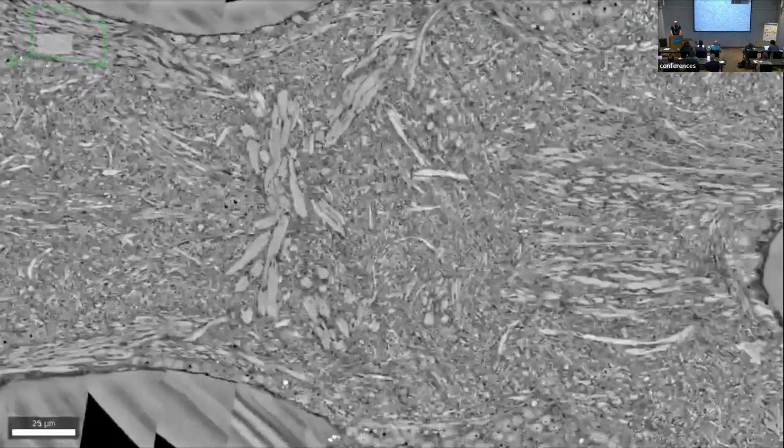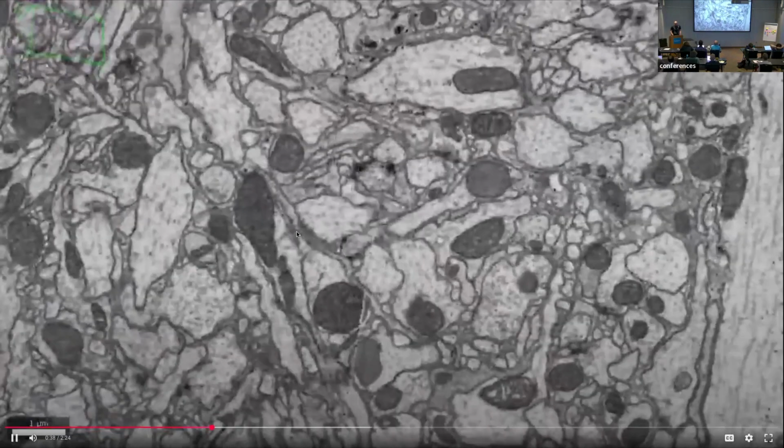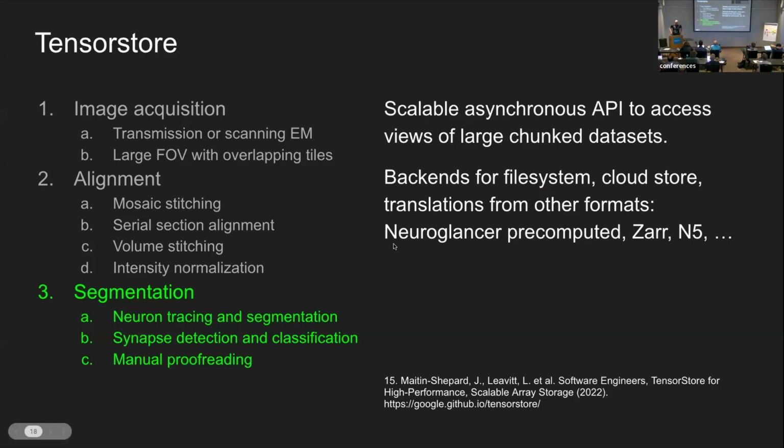This is to trace all the neural fibers. But you see right here, in the middle of the screen, this line is actually where the stitch is, where it fits, on screen.